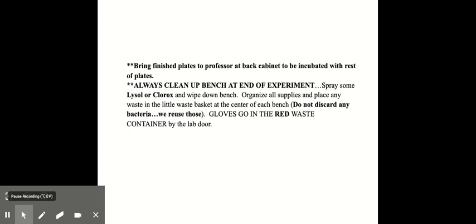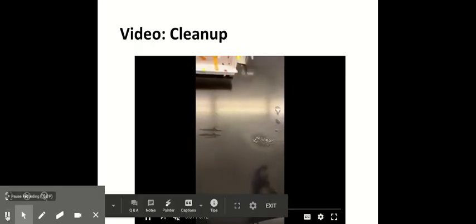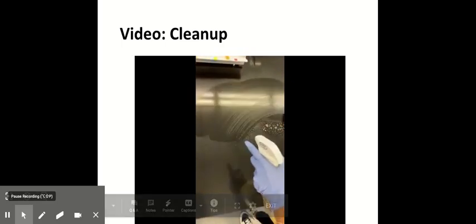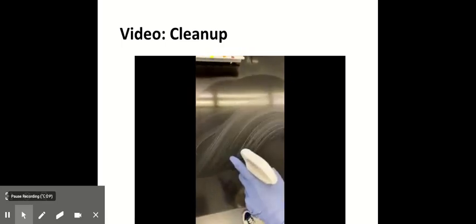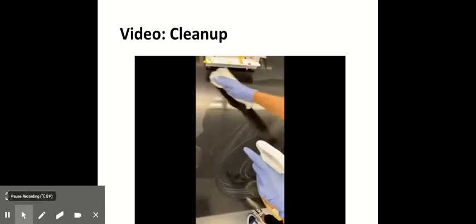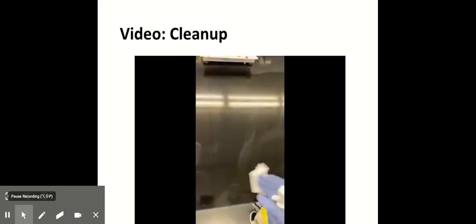And always clean up the bench, the lab bench, at the end of every experiment. You would do that by spraying with some bleach and wiping down the bench. And organizing all your supplies. And place your waste in the little waste basket that's at the center of each bench. And we reuse the bacteria. And remember, gloves go in the red waste container by the lab door. And one more video just to show you how you'd be cleaning up the lab bench with some bleach before you leave for the day.